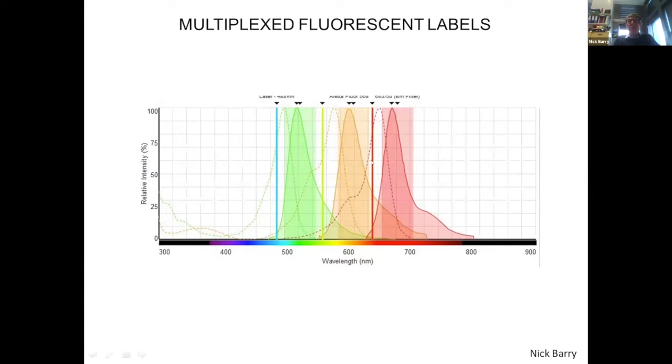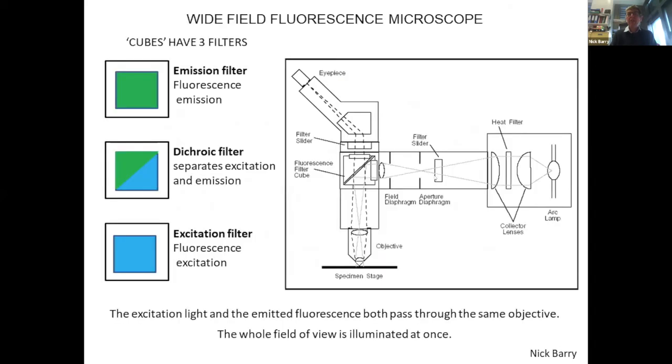Then in between those lines, a detection band, and you can have 3 colors. And then typically we might get 4 colors out, so there might be DAPI or Hoechst sitting down here. And then nowadays there are more dyes sitting up here, further into the infrared. So this is stuff that's invisible to the human eye at this point.